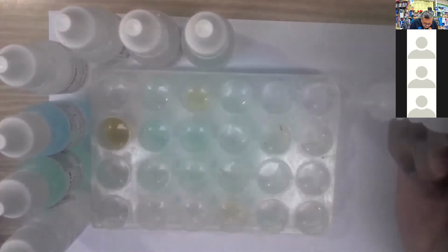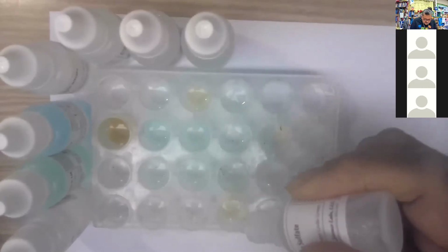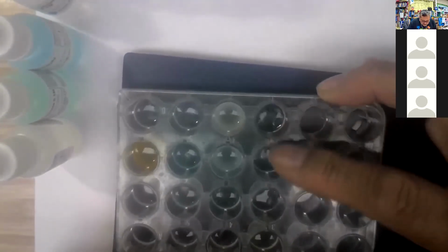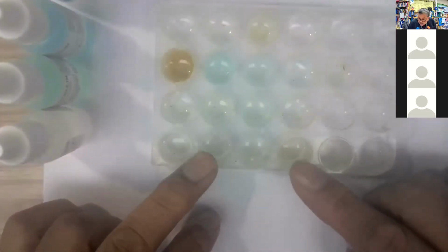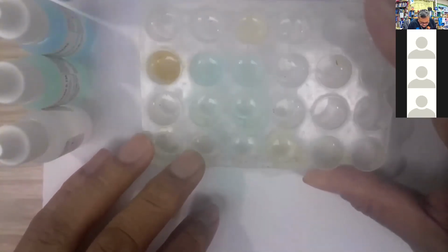1, 2, 3. Maybe a precipitate. See it better on the blue. 1, 2, 3, not really anything. And 1, 2, 3, not much there. In the second one, possibly a precipitate forming. Let's see. Maybe not. Hard to see anything now. The fourth row, whether it's on the dark background or on the clear background. Going that way, this one looks like a faint orange, but hard to know. That's just from what was there before.